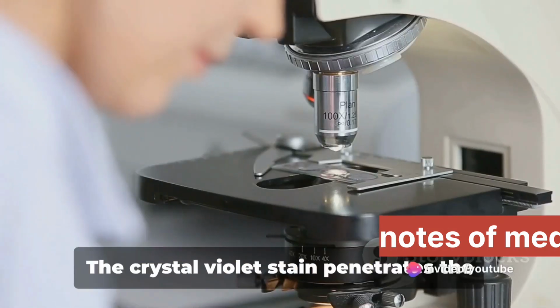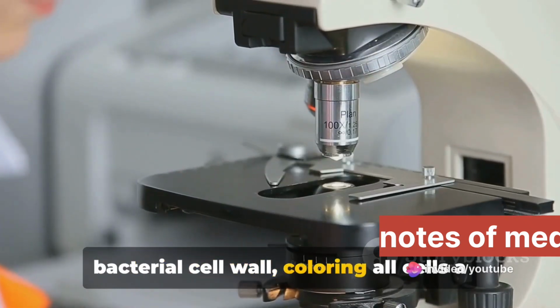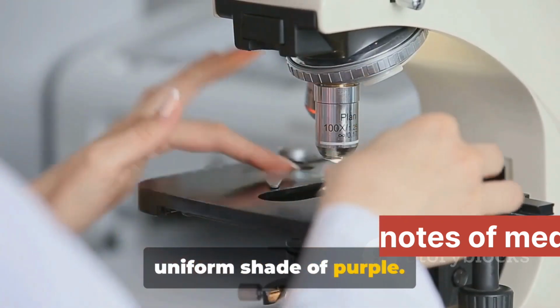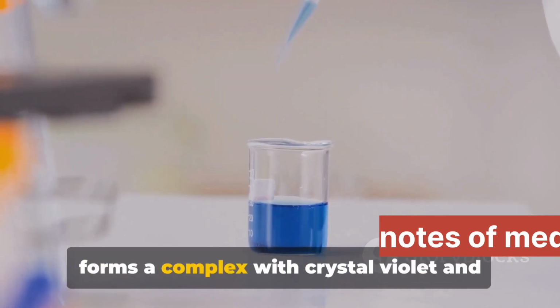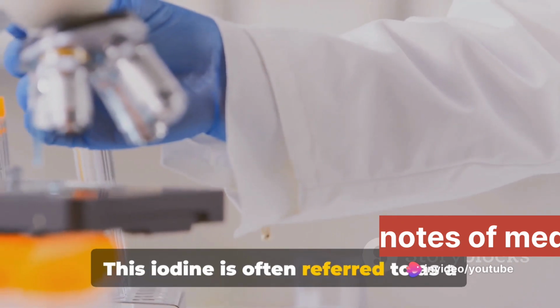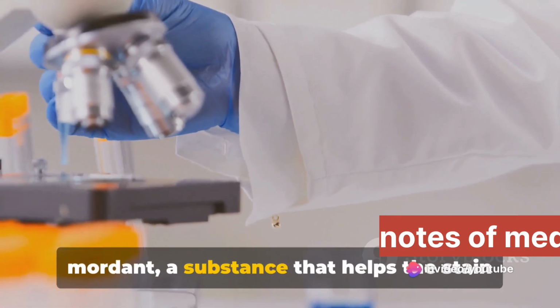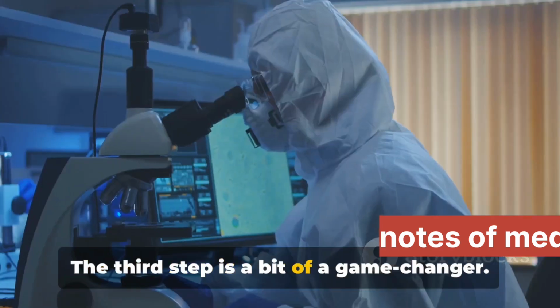It's a delicate balance. The crystal violet stain penetrates the bacterial cell wall, coloring all cells a uniform shade of purple. Next, we introduce Gram's iodine, which forms a complex with crystal violet and traps it in the cell. This iodine is often referred to as a mordant, a substance that helps the stain bind to the cells. The third step is a bit of a game changer.